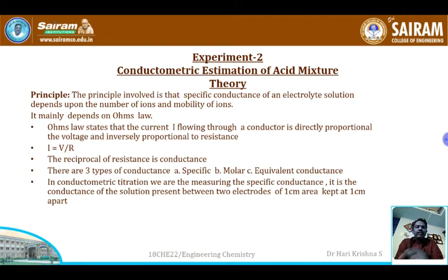And so I was discussing, right, what is resistance here? As soon as we tell conductance, the first thing says is reciprocal of resistance. That is true with respect to your solids. But here we are measuring the conductance of solution. So solution, it is completely different. How? So we are measuring conductance. Conductance here means mobility. So mobility of ions.